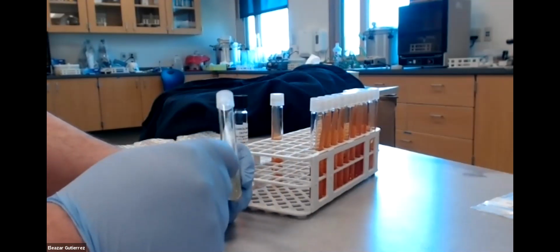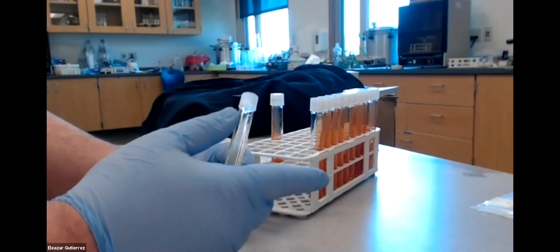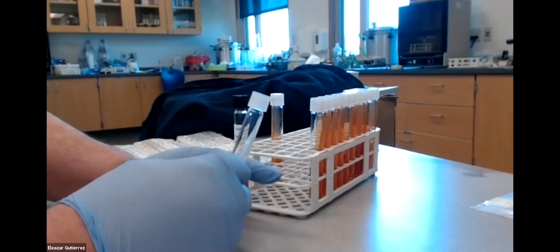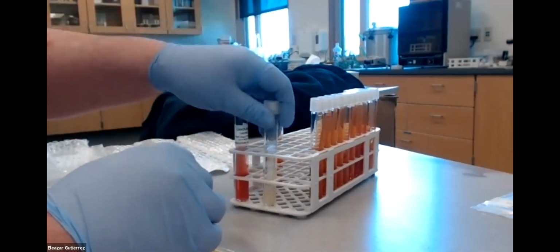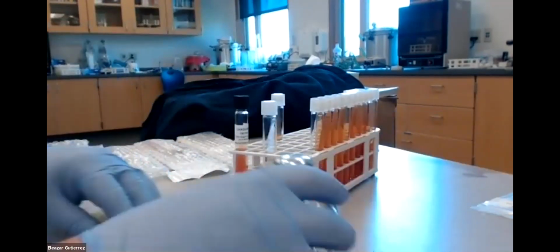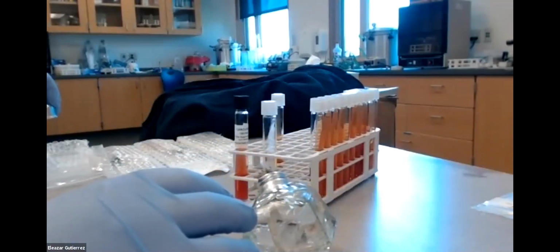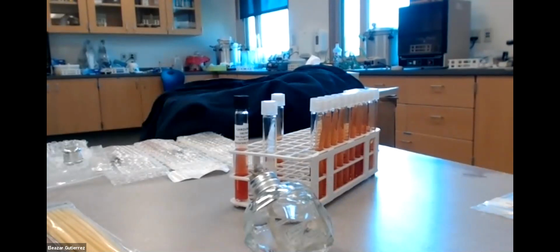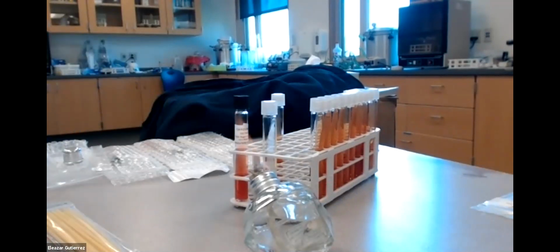Now, I'm going to demonstrate with the slant because all the bacteria that I'm handing out tomorrow morning to all of you are going to be in slants. So you might as well get accustomed to this guy. So I'm going to need my little lamp here. Mine's bigger than you guys. That's okay. It's all right. Here's my little lamp, alcohol lamp.